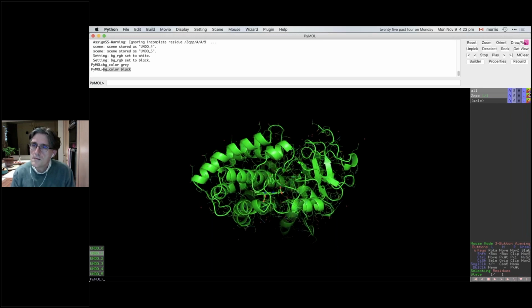So I can change the coloring if I click on the C and color by element. And then the very first one, you'll notice there's not even a letter C in that, and that's quite useful. For instance, if I color the entire object, I can go down to these color groups down here, and these are the names of the various colors that you can type on the command line. So if you wanted a background color that was 80% gray, I could type gray80. But I'm going to color the object. Well, let's color the object, I don't know, wheat.